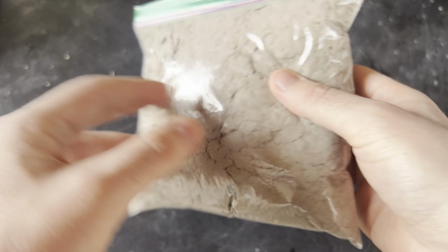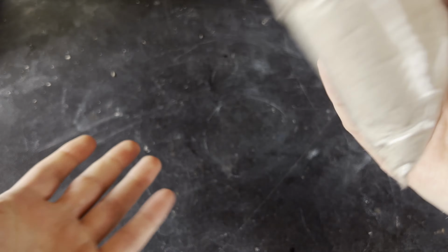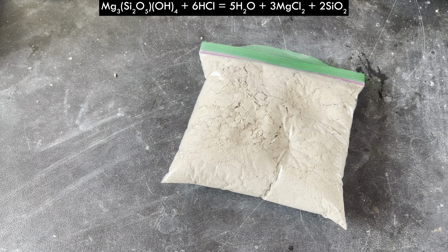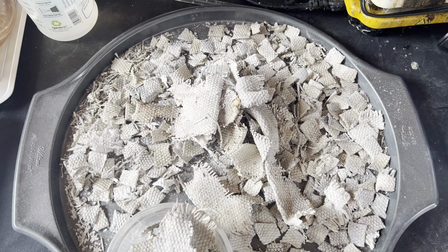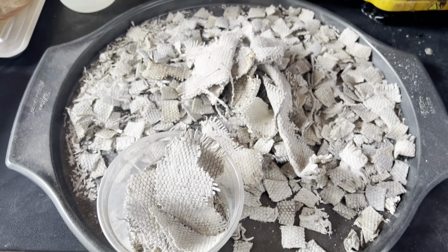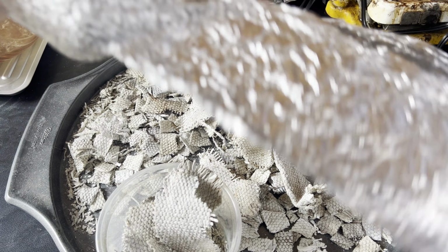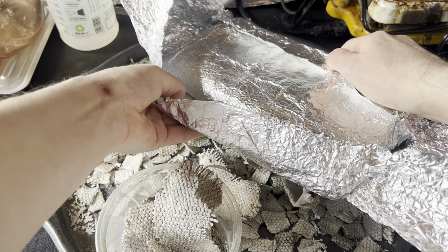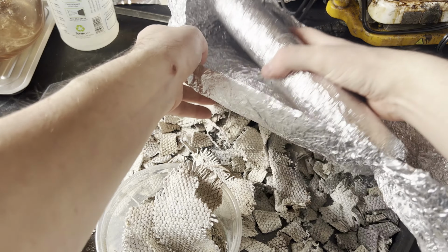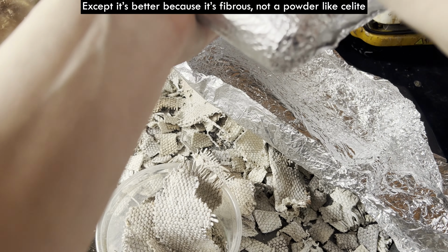Boiling with hydrochloric acid should dissolve any iron impurities and magnesium present from the structure you saw earlier. That's idealized. And it leaves a skeleton of nearly pure silica, which is what makes it such an inert filtering medium, and the retained fibrous structure makes it such an effective filtering medium. On a related note, if you know what Celite is, like filtering through a pad of Celite, it's diatomaceous earth that's been purified and treated in a certain way. It functions similar to that.